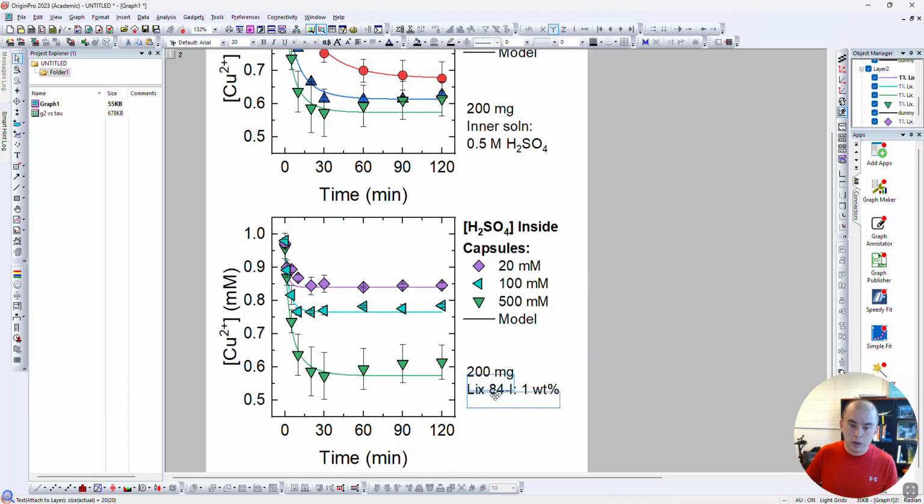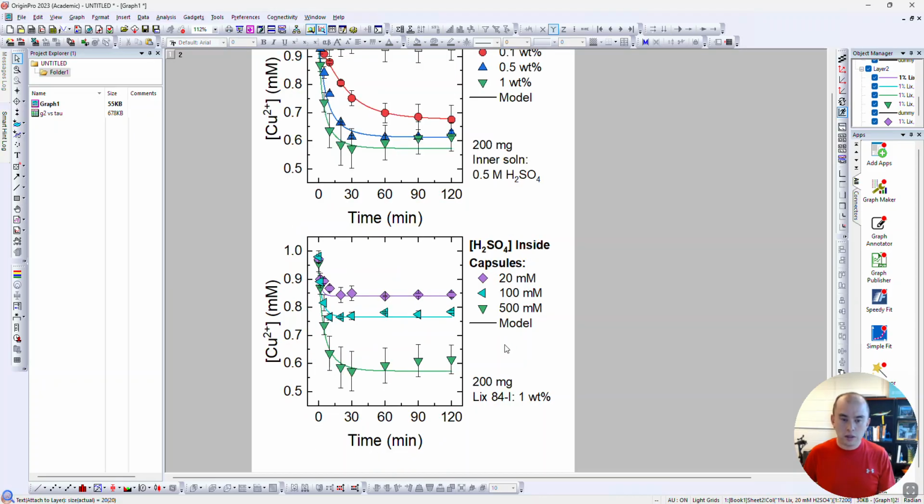And the reason I'm including this text box is so that, oh, and the weird thing about Origin, you can't sort of make things go up and down without moving left and right with your mouse. So I just use the arrows to move things up and down so that they don't move left and right.